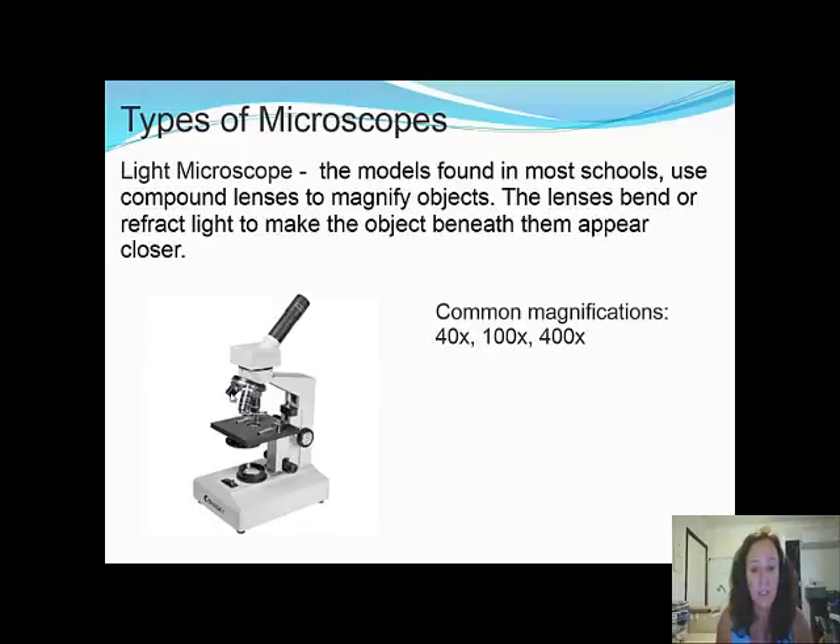The smallest lens is times 4, and the eyepiece is times 10, so times 10 times 4 gives times 40. The next objective is times 10, so times 10 times 10 gives 100 magnification — 100 times larger. And the largest lens is times 40, so times 10 times 40 gives 400 magnification. If you're doing biological drawings, it's really important to note the magnification, because depending on the magnification, it will drastically alter what you see.